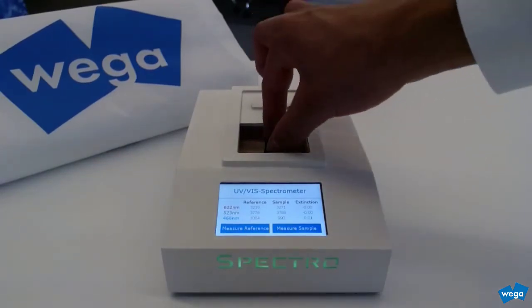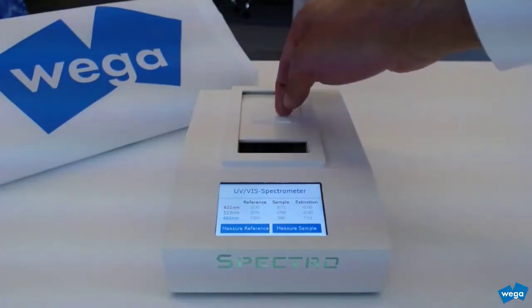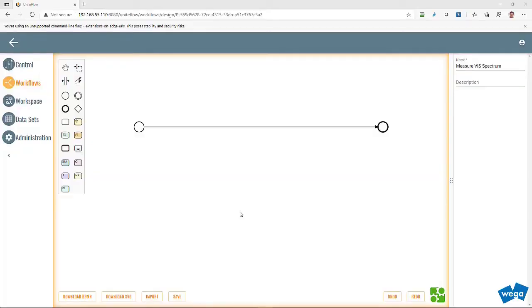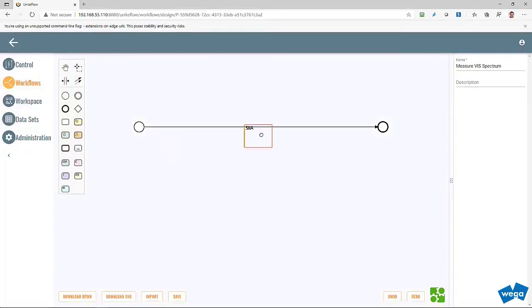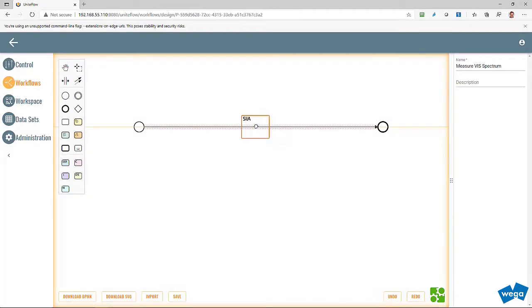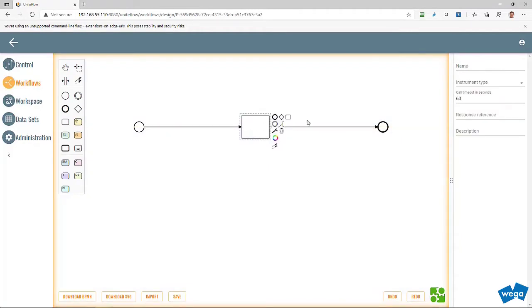Uniteflow is based on the Camunda open source BPMN implementation that has been extended by SiLA task. For demonstration purposes a workflow is created in Uniteflow.